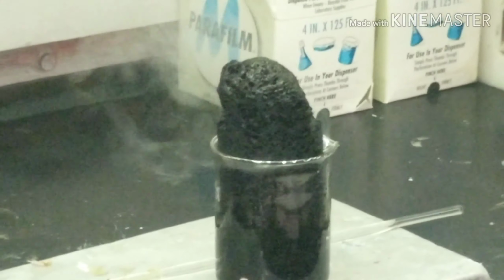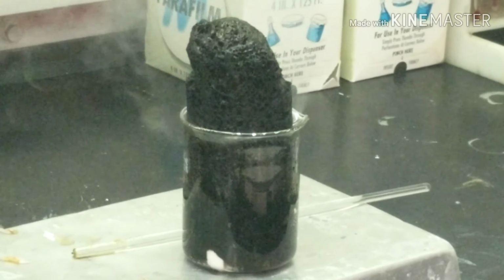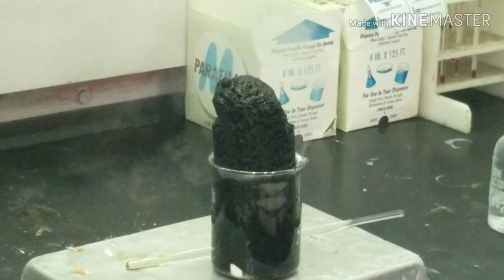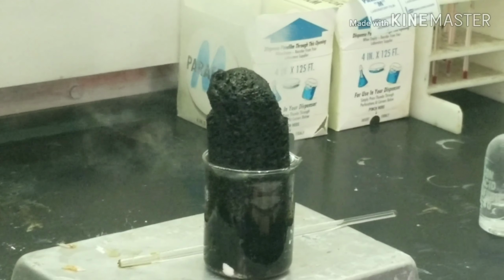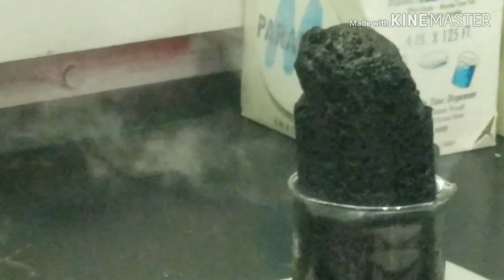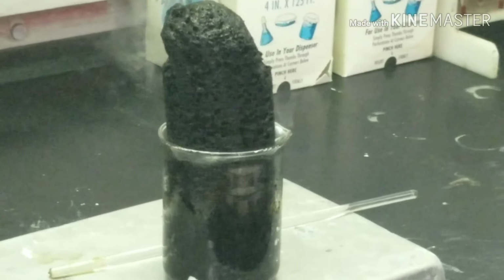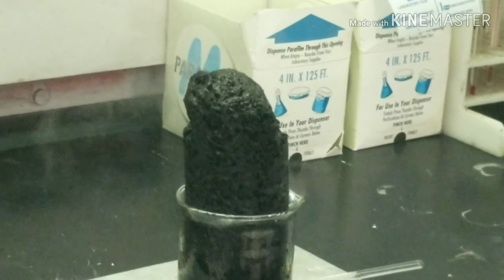It continues to grow, and that carbon has a fairly low density. Once it stops, I'll break off a piece and show you that it's fairly low density. It seems to be still getting a little bit higher here. At a certain point, the sugar runs out, and you're left with just some water and some sulfuric acid. Of course, the carbon as well. Looks like the reaction's slowed down quite a bit.